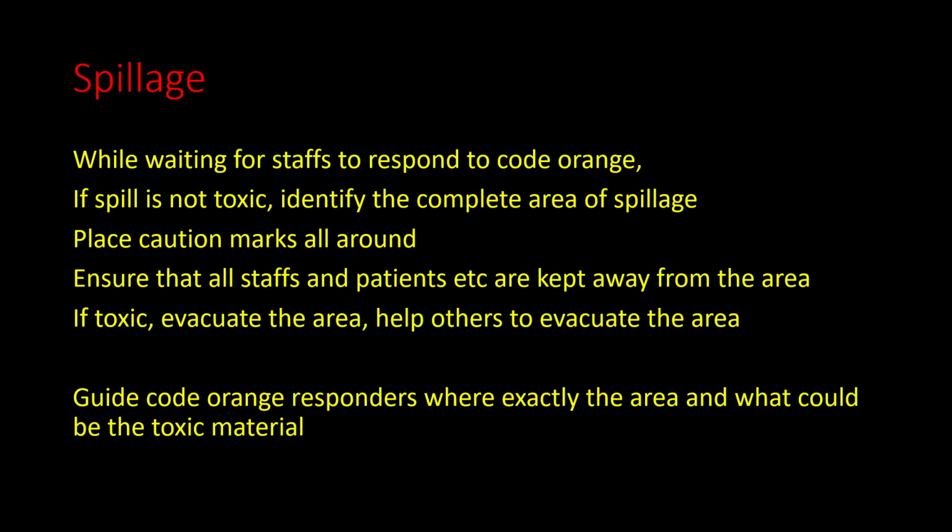When this is happening, and if the item is not very toxic, or it is just body fluids or something like that, please don't stand alone. Don't be a bystander. Be an active part of the whole code. See what area the spillage has covered, and try to put a caution board so that others don't walk on it, or prevent others from moving into the area.